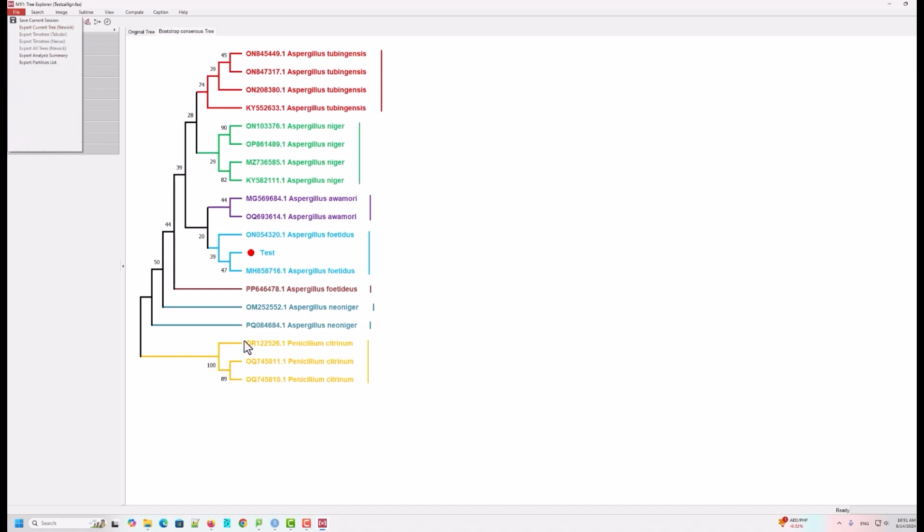When we make the phylogenetic tree, after that, if you don't want to use MEGA for the coloring and formatting, you can use some other software for the formatting. We will discuss those software in some other lecture, in some other class. Then you need to save this tree in a format that the other software can pick up, and you can import the tree into those other software.